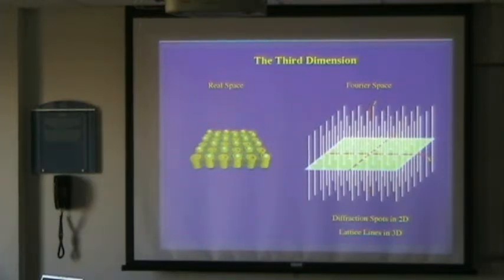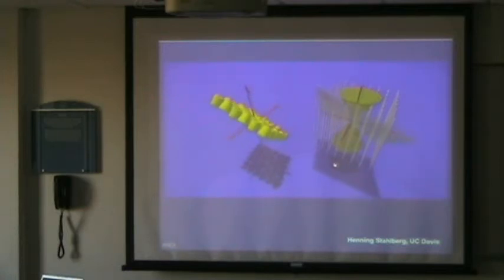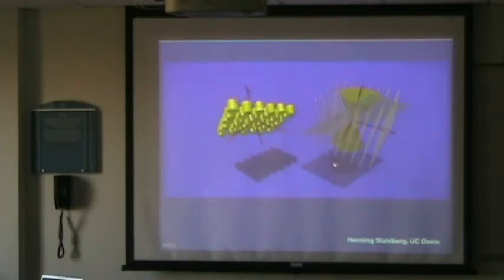So that means essentially this. When I have a 2D crystal like this, such a packing, we have discrete information in x and y, according to the lattice lines here, but we have continuous information in z. And now we have to collect this continuous information. The way we collect it is by tilting the crystal. When I tilt the crystal, I fill up the space with this plane here.